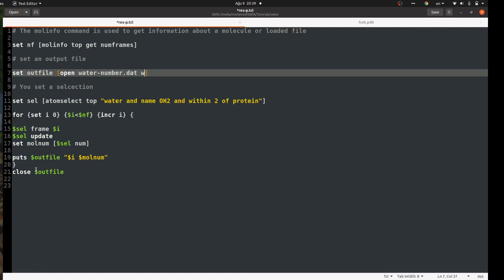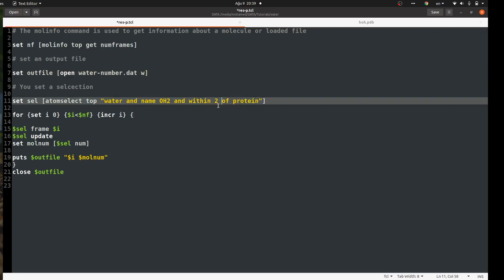With these two variables — the frame number and the corresponding molecule count — I use the TCL 'puts' function to write them into the output file. Then I close the output file. To summarize: we got the number of frames, set an output file, set a selection with a distance you can change to any value, wrote a for loop over the whole trajectory, wrote the data to the output file, and closed it. Now let's apply it.